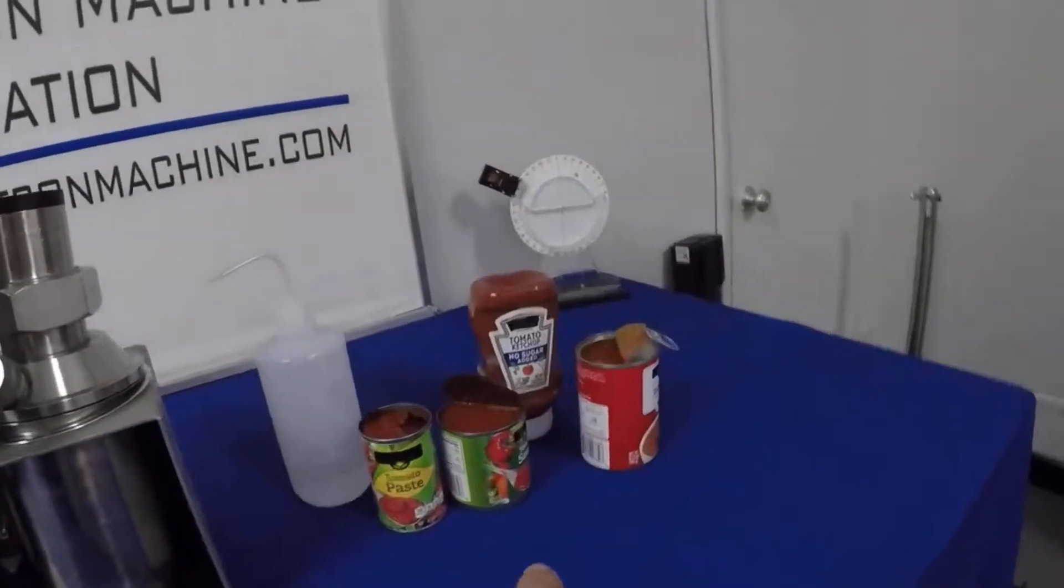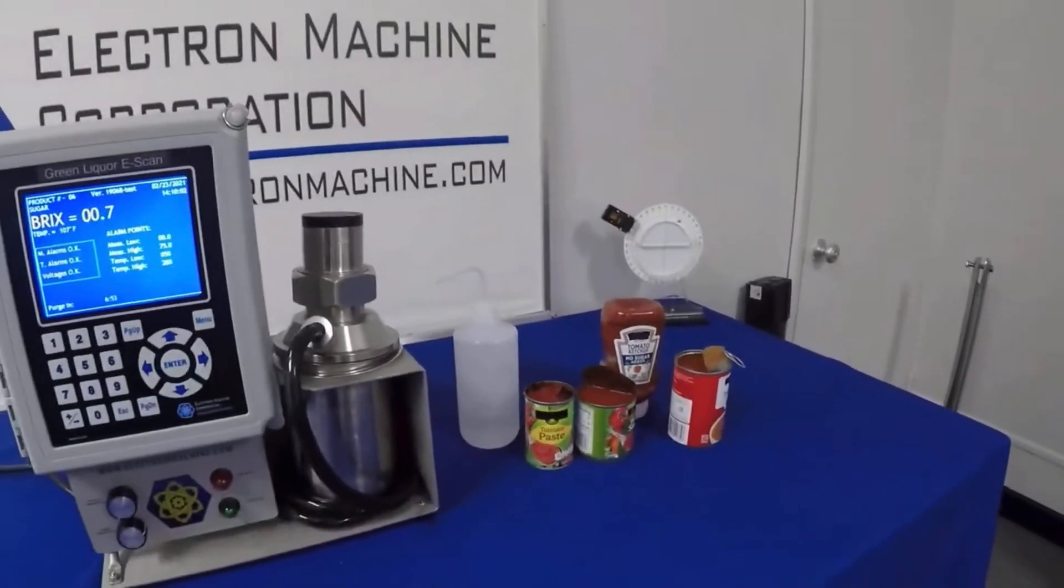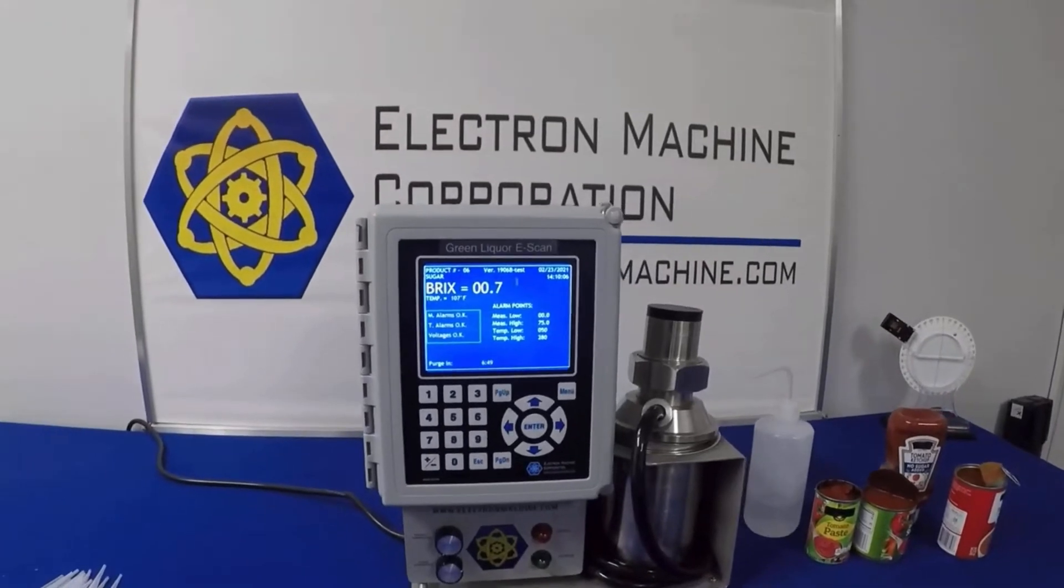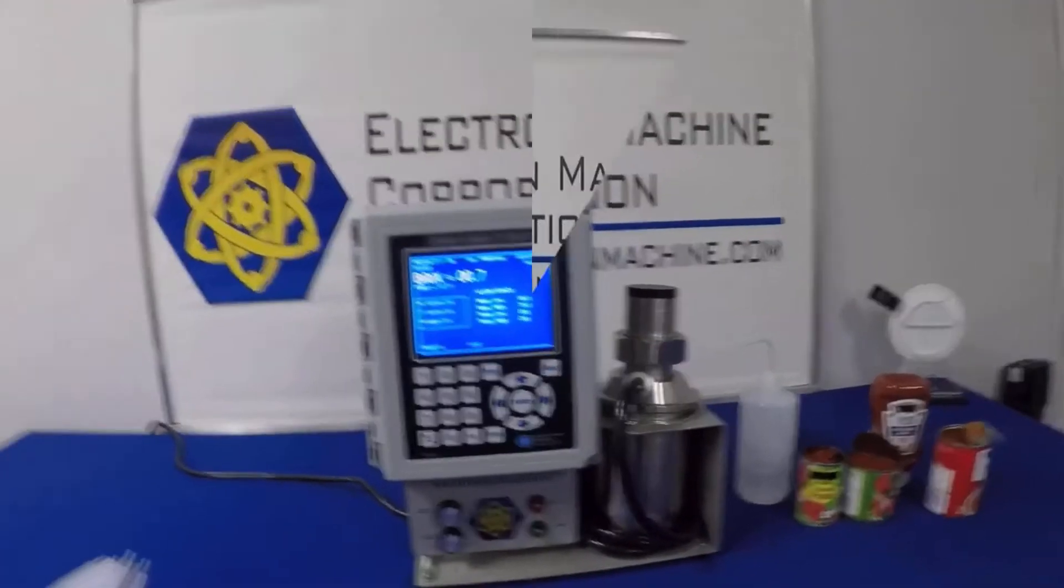Our refractometer is used in a variety of industries throughout the world. The next series of videos will highlight some of the most common applications for our refractometers. Today we have our NPR e-scan set up in a static display. We have a variety of tomato products that we are going to test to show you how the e-scan refractometer can read and measure different tomato products.